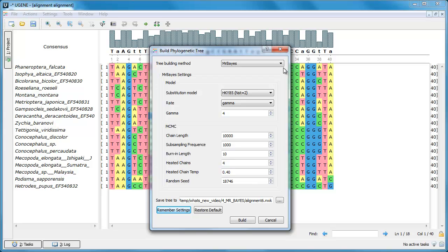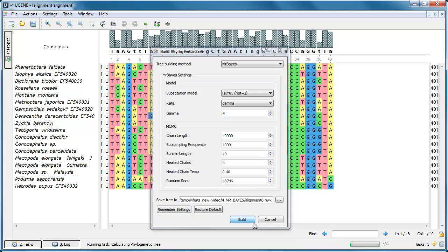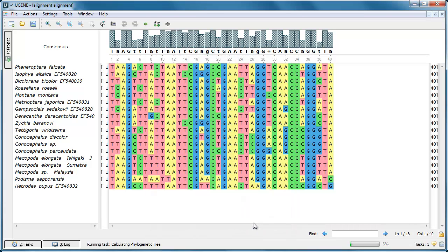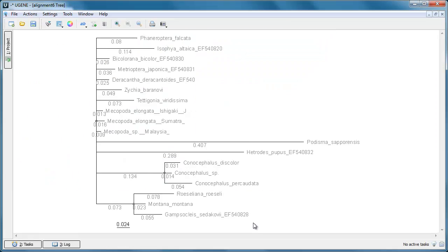You can use the default parameters and click the Build button. The resulting consensus tree is opened in the UGENE phylogenetic tree viewer.